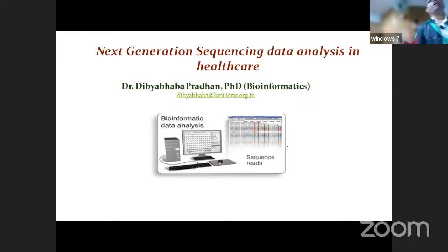So good morning all. So today I will be talking about next generation sequencing data analysis. So from your introduction, most of the students are basically from genomics and evolution. Okay. So as you are aware that NGS is one of the most recent techniques where you can sequence the complete genome of an organism in a single day, in quick time. For example, I will take the example of the human genome. You can even sequence it within 2 days.